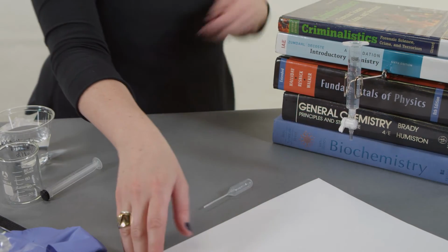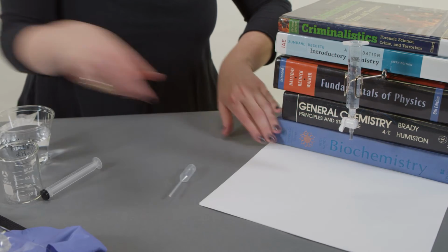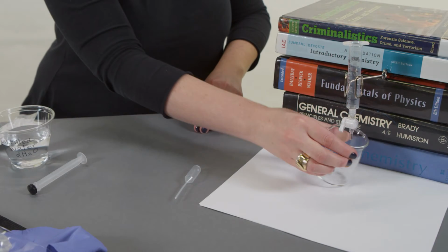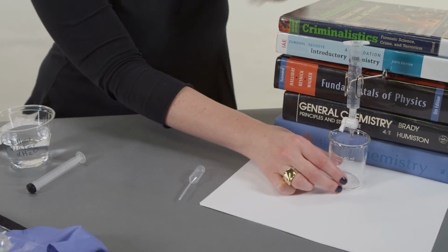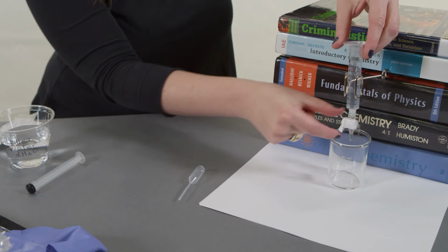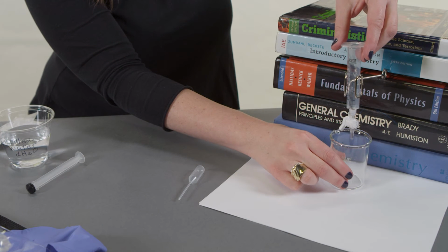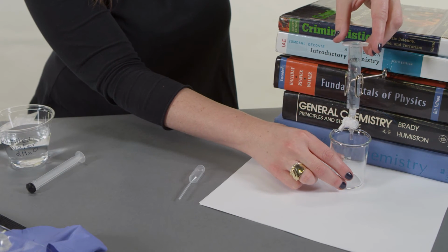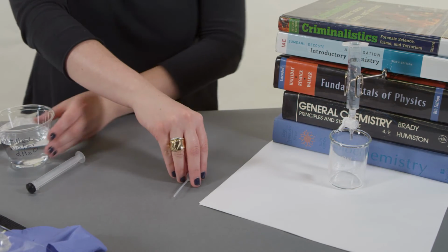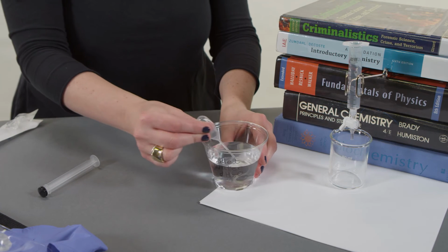Place a sheet of white paper next to the bottom of the stack and set the beaker on the sheet of paper. The end of the stopcock should be located approximately 1 centimeter above to 1 centimeter below the top of the beaker. It is important that the placement of the burette allows for the white knob to be easily adjusted. If this is not the case, slightly adjust where the burette is located in the test tube clamp.